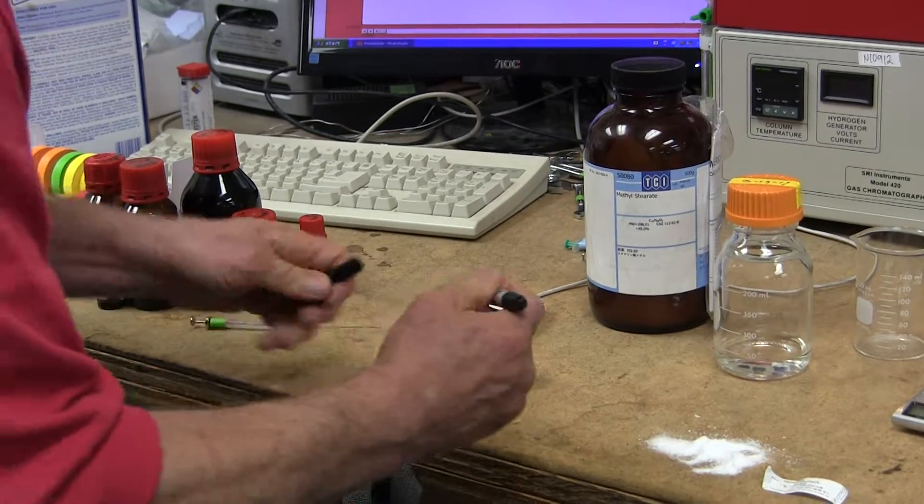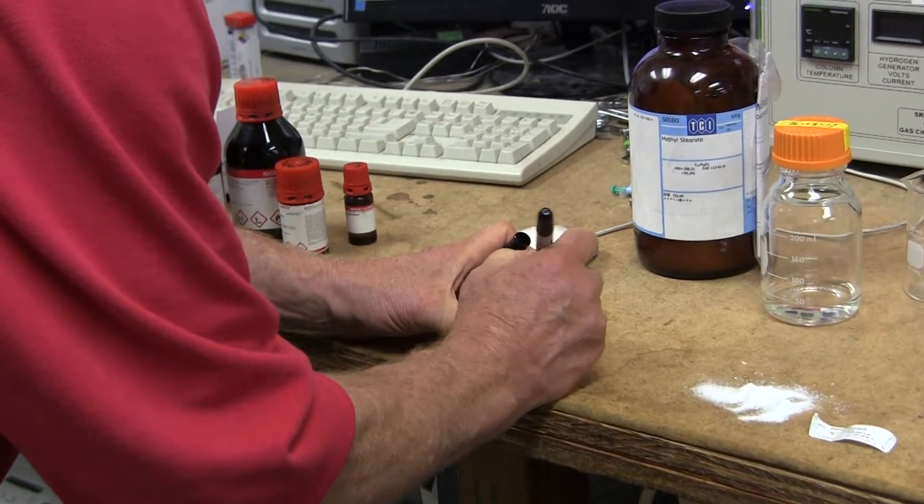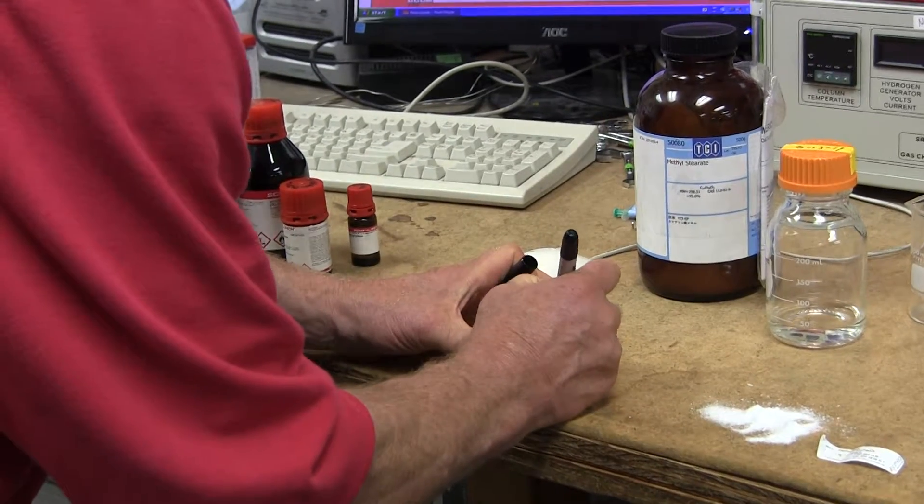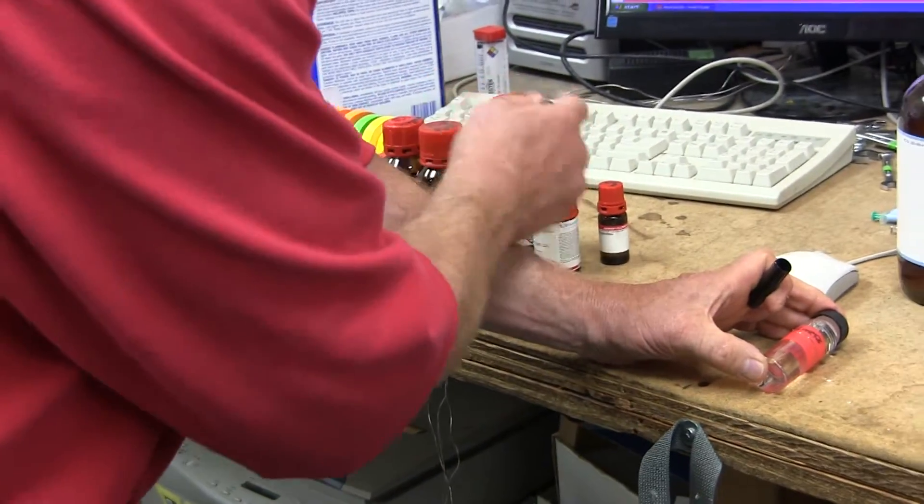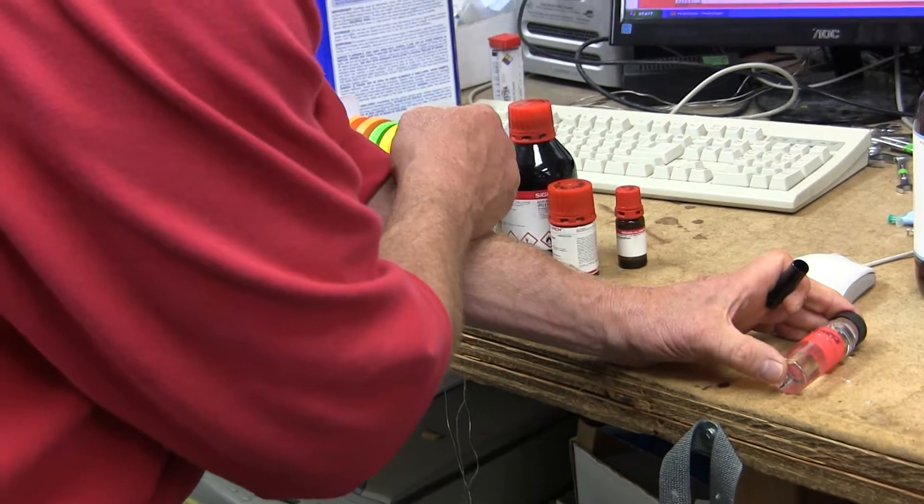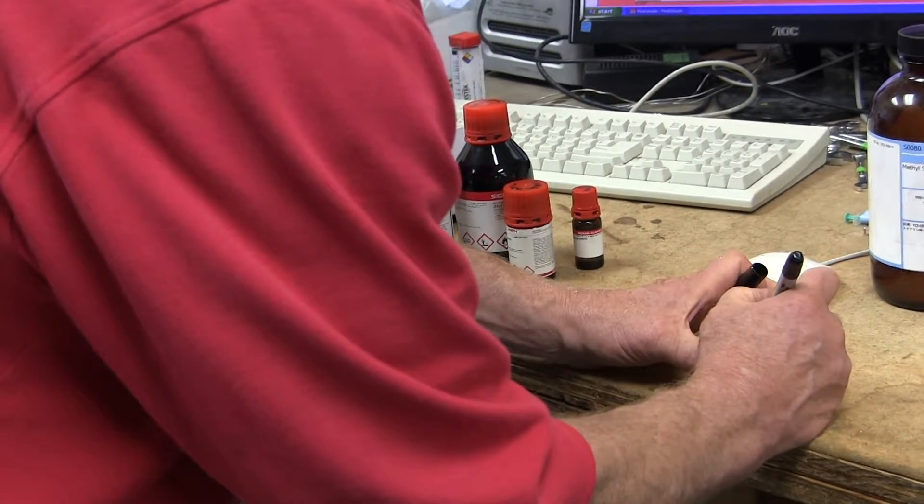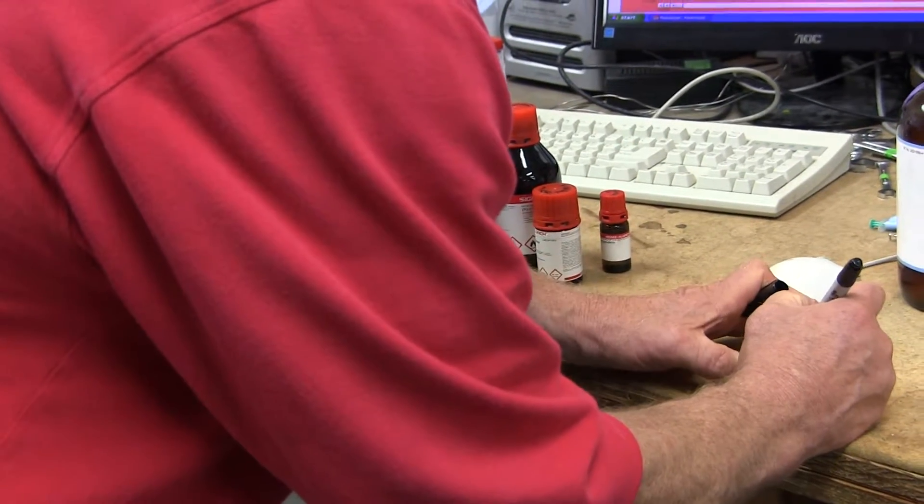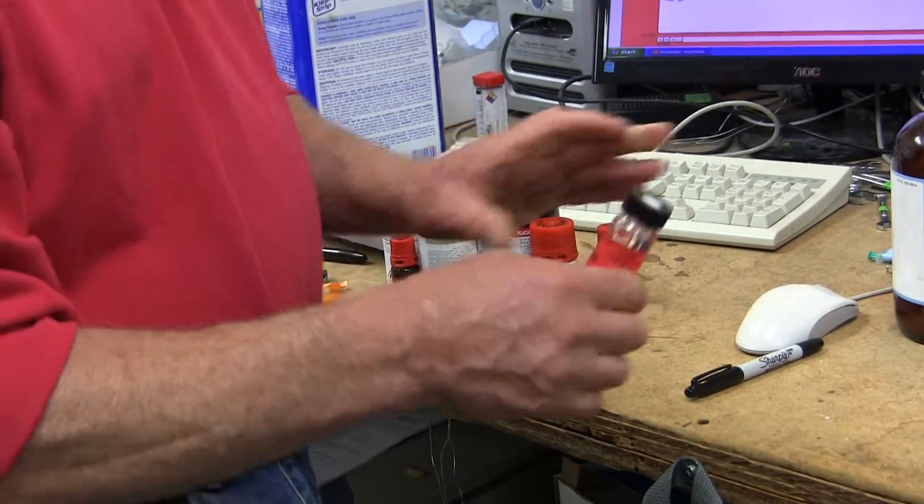I'm just going to label this as six terpenes for right now, but you would probably want to label it with the actual six terpene names: the alpha pinene, beta pinene, myrcene, limonene, linalool, and beta-caryophyllene. And then, of course, the date, because everything needs to be dated so you know that it correlates to a certain batch of internal standard solution.